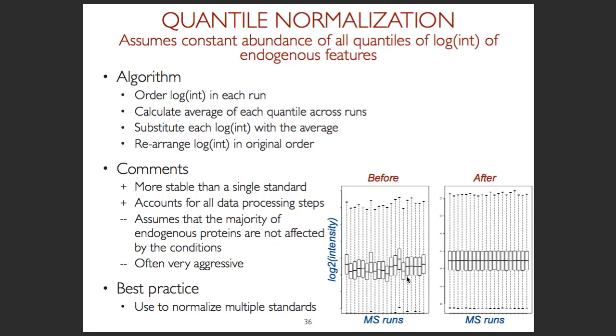That is useful because digestion can affect different runs in different ways than mass spectrometry, right? And so you cannot really have a single adjustment to everything the same way, right? And so that can be quite useful as well. Yeah. And by the way, this is another thing.